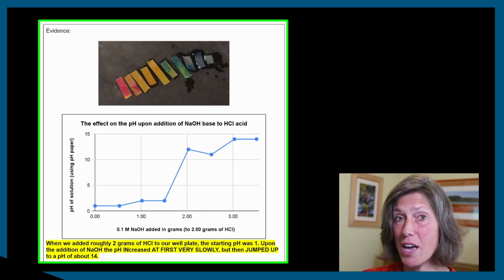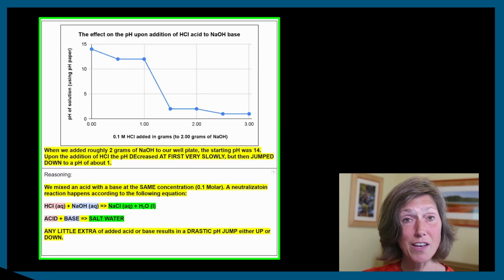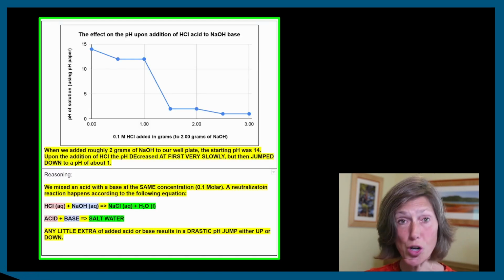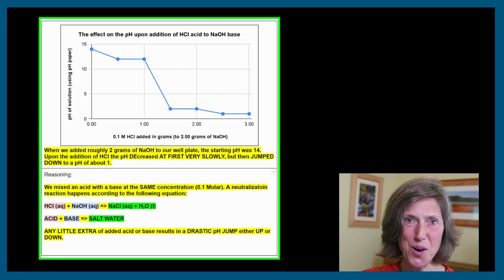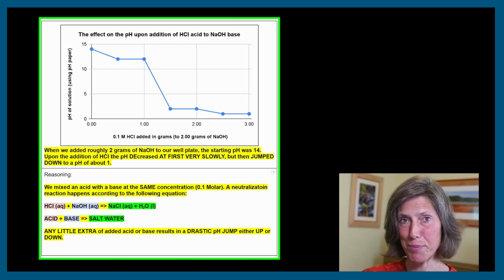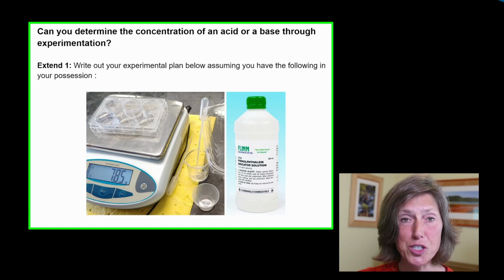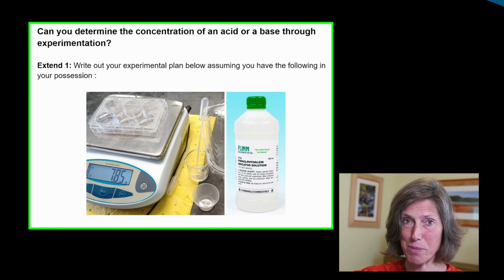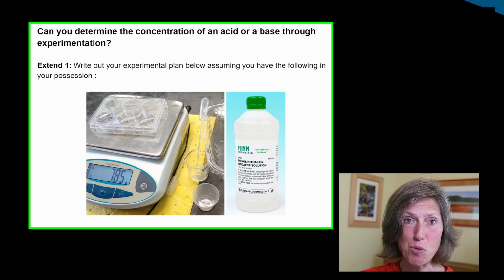And you see here that very distinctive sigmoid curve. Again, if you flip it and you start with the base and you add the acid to it, that will also cause the sigmoid curve to flip. So they've explored acids and bases. They've further explored combining acids and bases. They've seen the trend in a graph form.